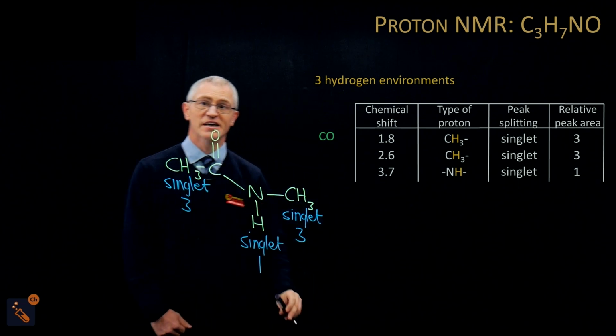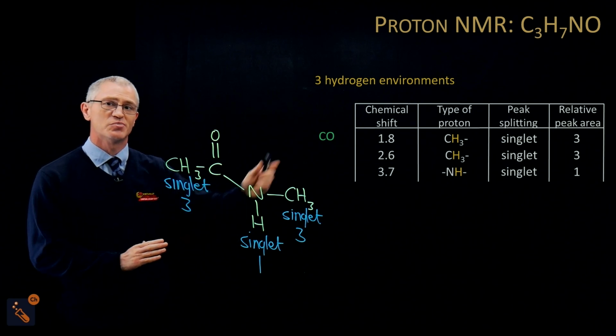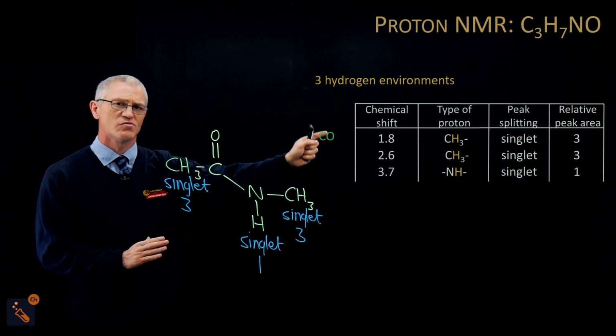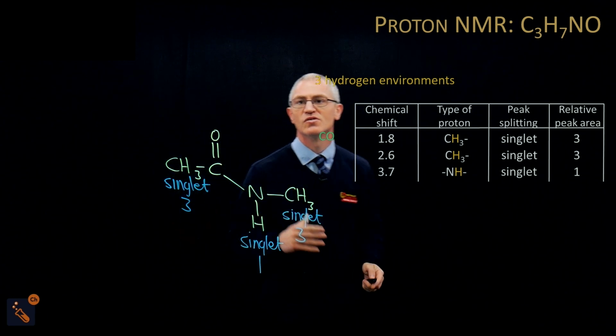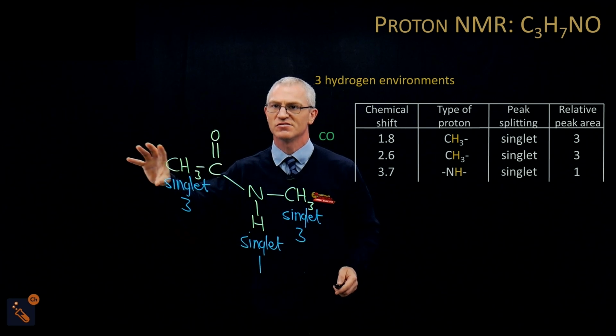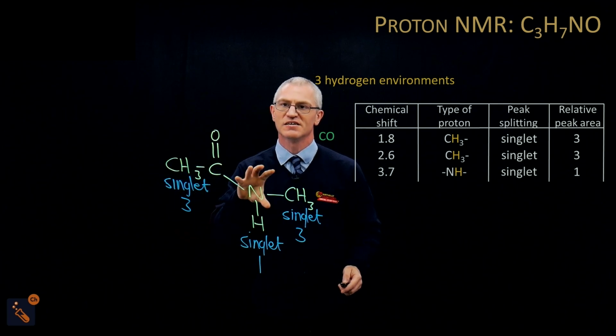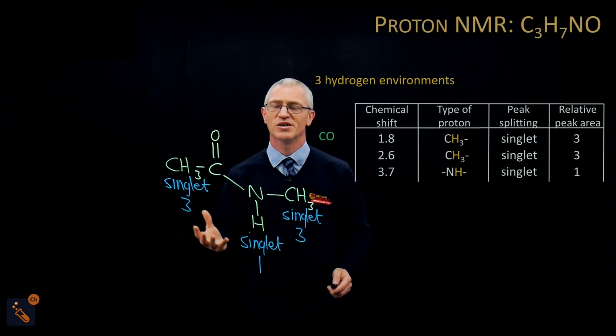But the problem we've got again is we know what our structure is, but which one is it? The problem you've got is when you go on your data sheet, you can see that CO, CH, the CH, CO, and this NH, CH, and you should be looking at your data sheet right now, come out in the same place, 2 to 3.